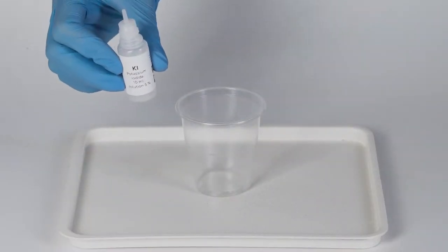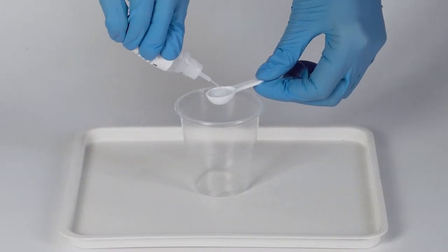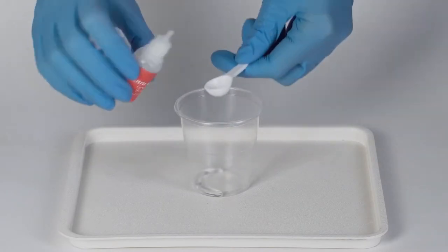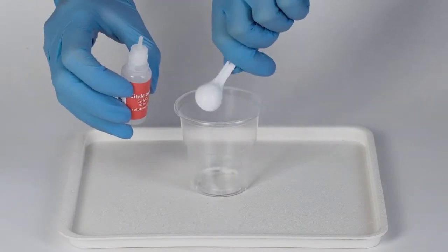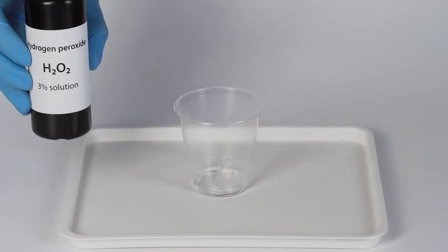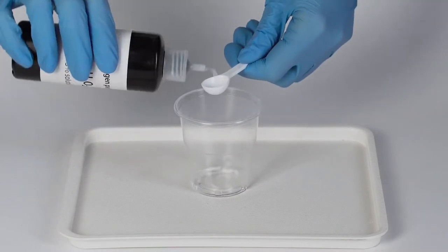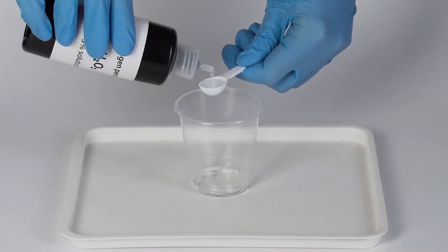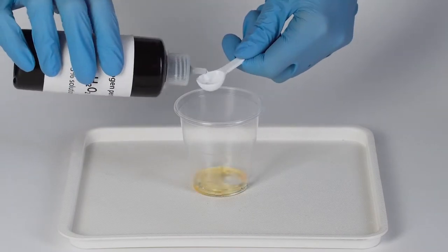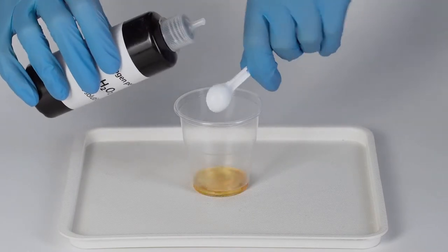Add one big measuring spoon of potassium iodide to the disposable cup. Then add one big measuring spoon of citric acid solution into it. Next, pour three big measuring spoons of 3% solution of hydrogen peroxide, which can be found at any pharmacy, into the cup.